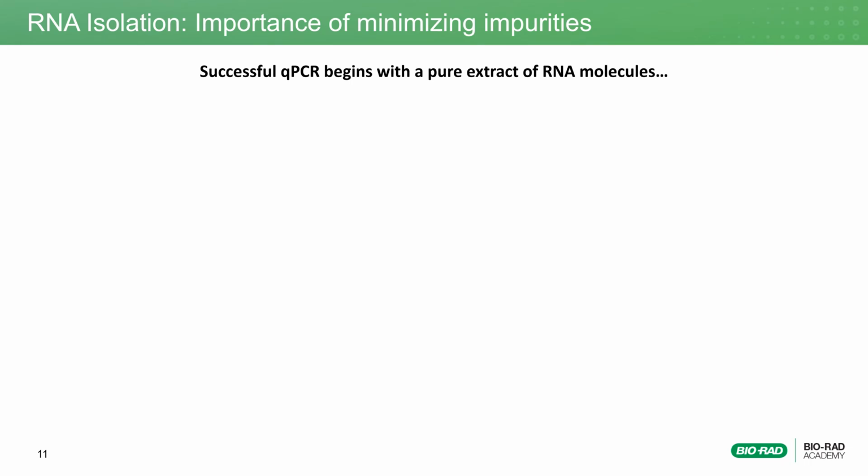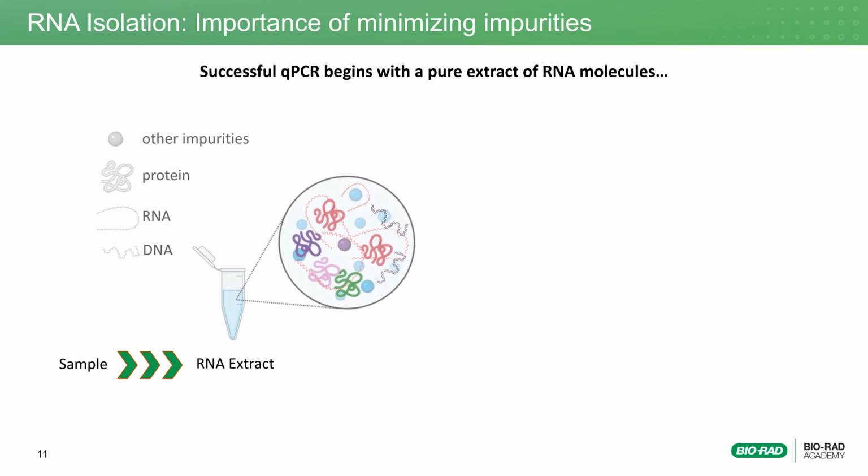Extracting a pure RNA sample is a crucial first step to achieving success when utilizing RT-qPCR for gene expression analysis. The nucleic acids extracted from biological material need to be sufficiently free of components which may inhibit enzymatic reactions. Semi-quantitative measurements using RT-qPCR are particularly susceptible to inhibition, as small amounts of co-purified inhibitors can have relatively significant effects in downstream analysis. Let's take a look at our current sample of RNA extract below to see how each of the co-purified molecules affect downstream steps involved in RT-qPCR.